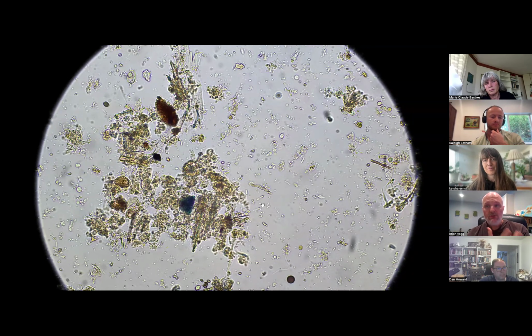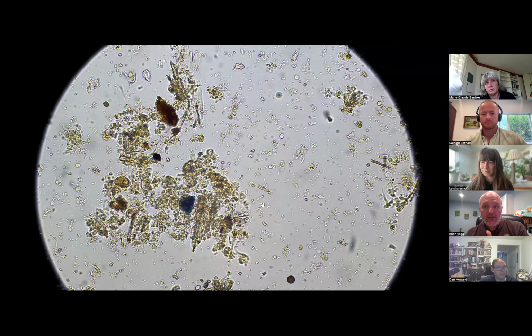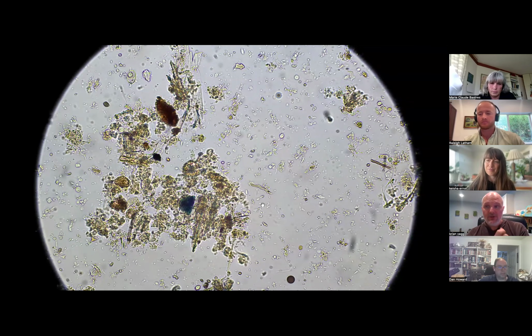I mean, the more hours you put on the microscope, your eyes and your brain get trained to recognize certain patterns and shapes and things. And after looking through so many samples, it becomes very easy to make certain intuitive impressions about that soil, the quality of life. So what we want to do is just make sure that people have those skills to be able to use a microscope effectively, and they have the basic identification skills.